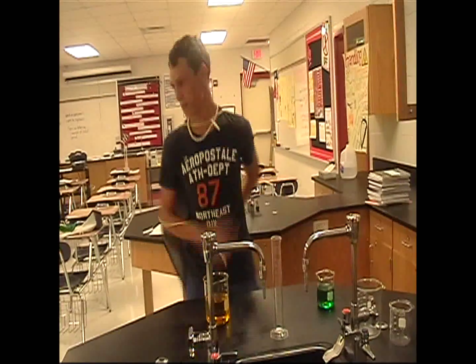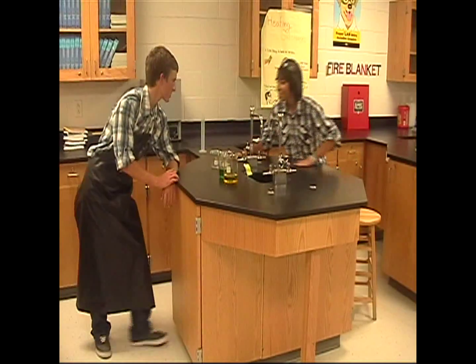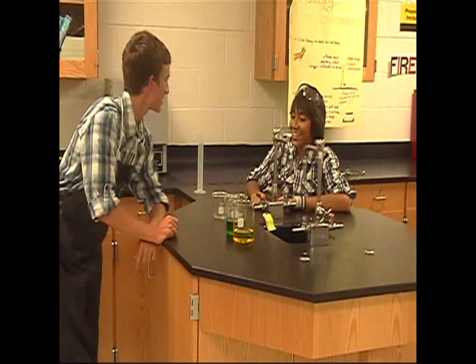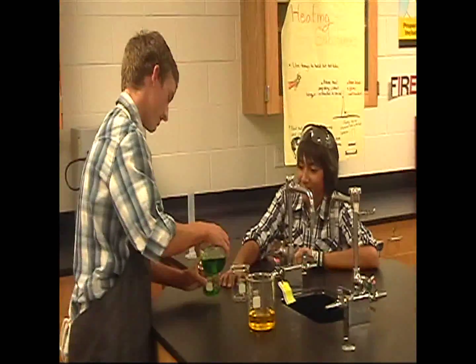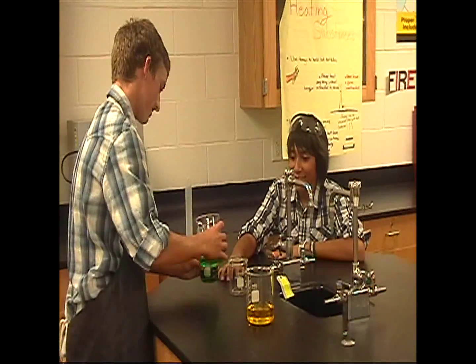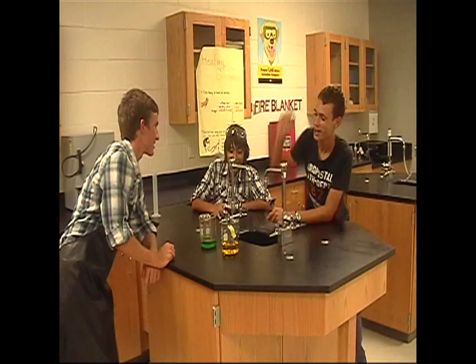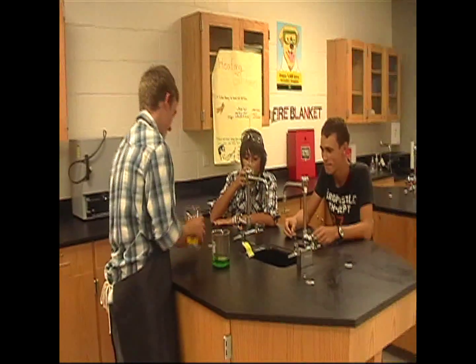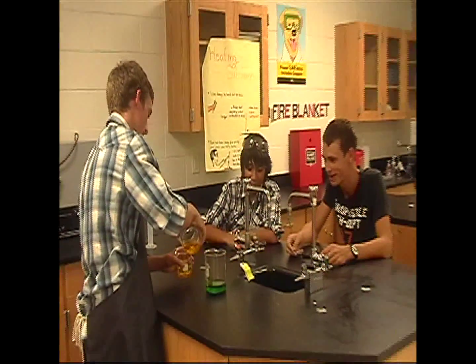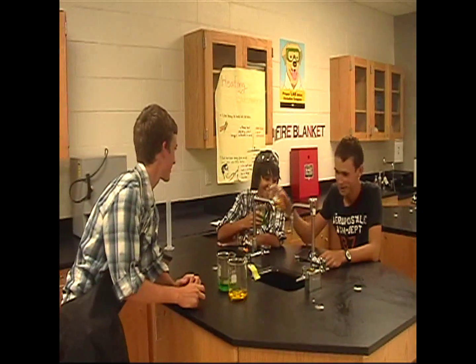The video ends with chaotic, mostly incoherent exchanges including references to breaking things, making a mess, and turning something off. Characters ask each other if everything is good, concluding the demonstration in a disorganized comedic fashion.